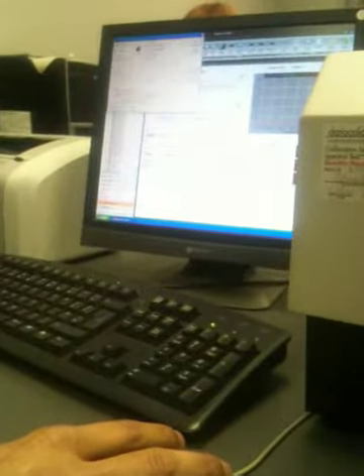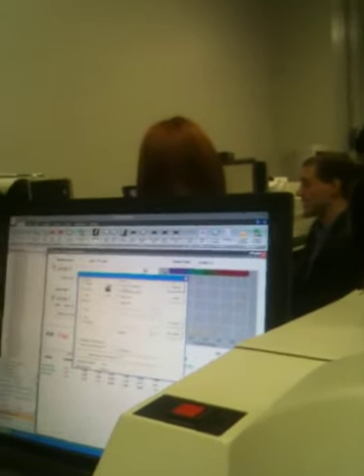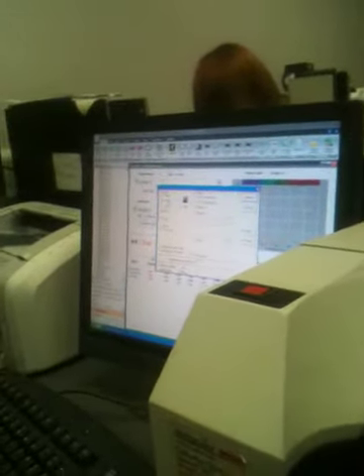Now we're going for the calibration directly. Here there are some options. One of the options is calibration time, which is 8 hours. You can change it to 6 hours if you want. There is a UV filter, which means in daylight there is UV, so you choose whether to include UV or not. If you include UV, it's 100% UV. If you don't, it's 0% UV. There is also aperture: small, large, and ultra small. So you use the small. And there is specular, include or exclude.